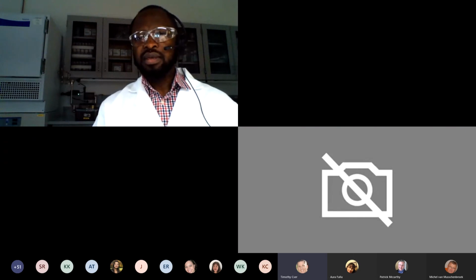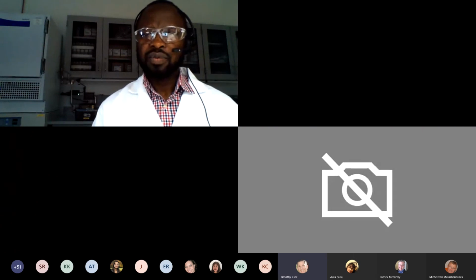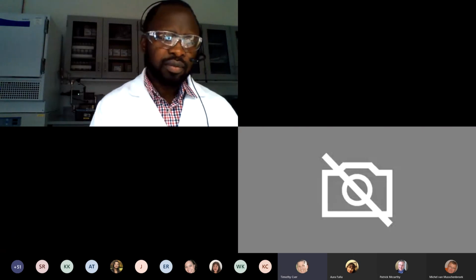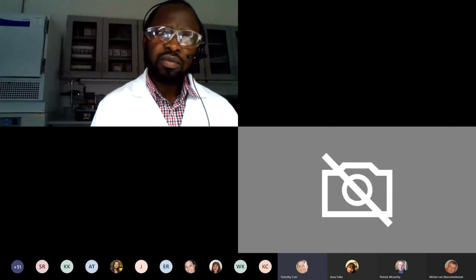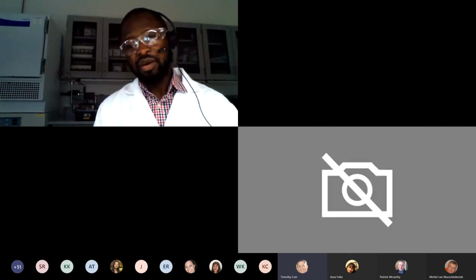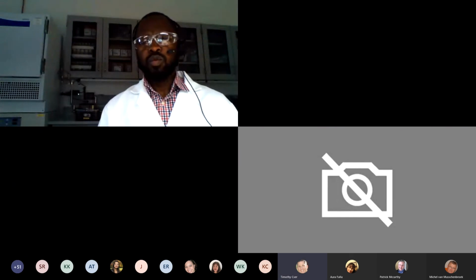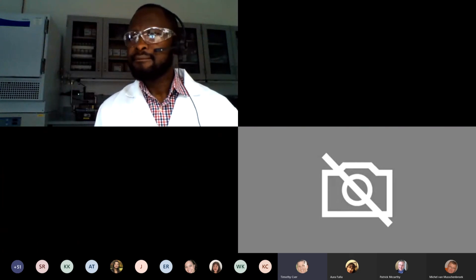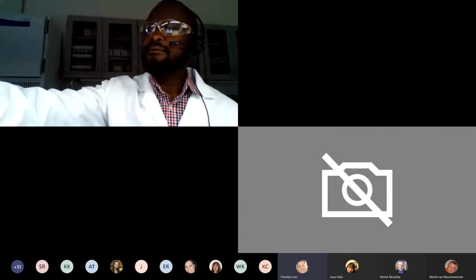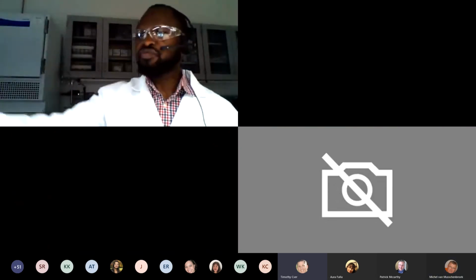Yes, yes. And did you talk, sorry, I missed the beginning, did you talk about the difference in filtration rates between the blue and the red and the green, as far as which ones filter faster? No, I did not. We recommend the blue. Blue has the most options from the canister sets, and the blue will filter faster because the MCE membrane's porosity is looser compared to the porosity of the PVDF.